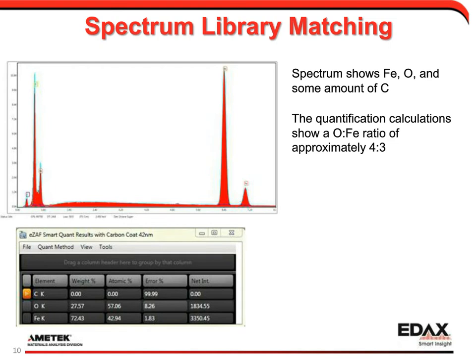Before anybody posts questions to the Q&A, what happened to the carbon? That is because this is a carbon-coated sample. I have applied a carbon coating correction. So in this case, we have about 42 nanometers of carbon on top of the sample. That's included in the calculation, and that's why we see 0 weight or atomic percent down here for carbon, even though we can clearly see a carbon peak in the spectrum. So that's a routine we can apply to our quantification when we know that carbon is not part of the material but a coating on top, and we can pull that out.